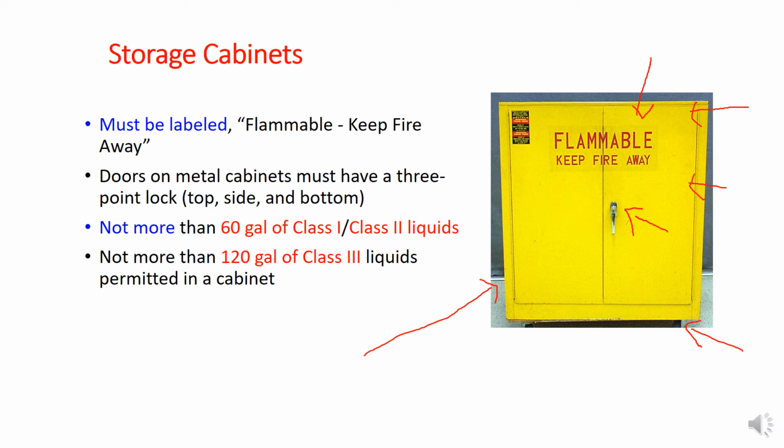And secondly, if in future you have a chance to visit any bio labs, you can see these yellow cabinets are not very big. They are very small, because these are flammable. The cabinets do not allow you to store a huge number of chemicals. They have a certain capacity or limit.